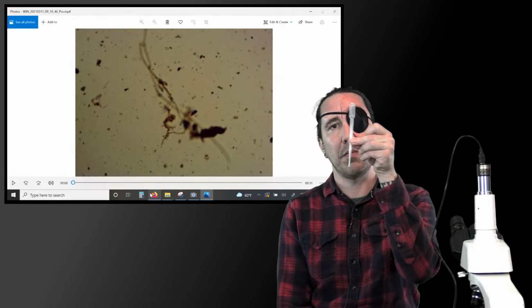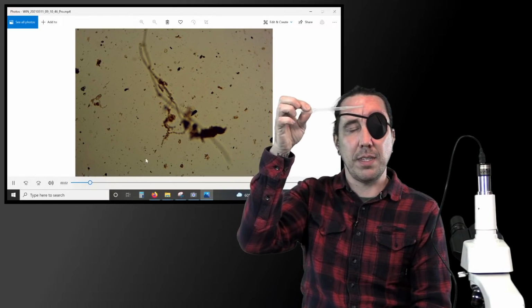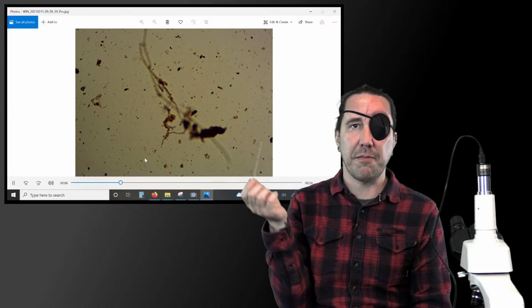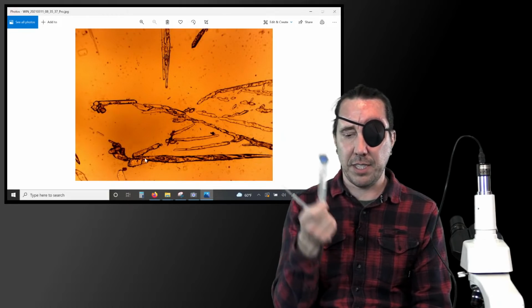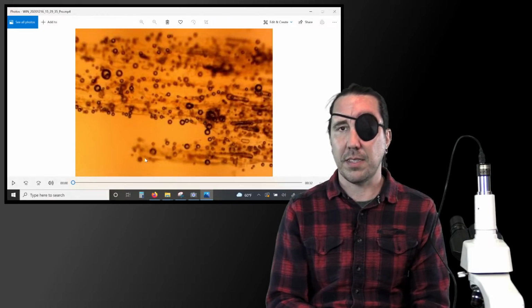And then I've got plastic pipettes. You can get glass pipettes. These plastic ones, same thing. It's hard to find those in small quantities. You generally have to buy like 50 packs, 100 packs. So I've pretty much got lifetime supplies of centrifuge tubes and pipettes and slides.